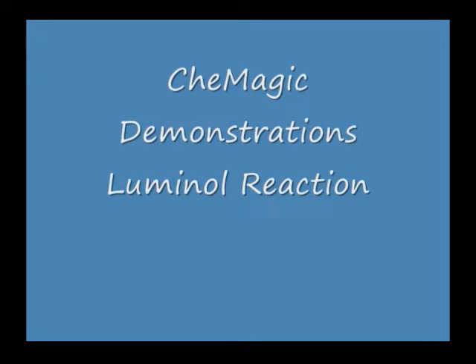This demonstration starts with a dilute solution of luminol and hydrogen peroxide that we make from a stock solution of luminol. The stock solution will degrade with time, but we've kept the solution for well over a year with success. To develop the chemiluminescence, we use one drop of blood. Demonstrators that have a problem with this approach are advised to use potassium ferricyanide.